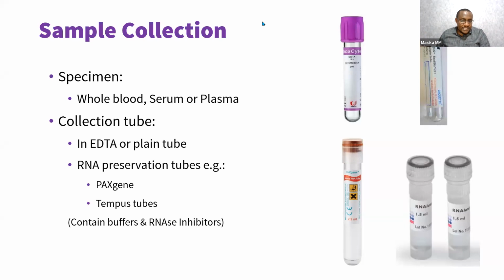I don't understand that. I think the primers are recycled and then they're also added in excess. Yes, that's true. Every cycle, you add enough primers, and usually in optimization, you know what you need and the quantities. There are calculators for this, to know that for this primer, I want this concentration. And so you put it at the right time. But then that's why we don't run PCR for 100 cycles, because then you will use up all your resources, the dNTPs, your enzyme, your primers. But if you're running 40 cycles, we keep reusing these primers because they attach and they anneal.